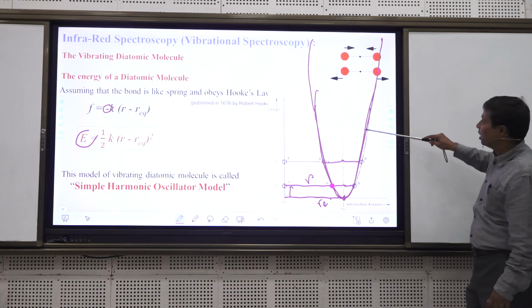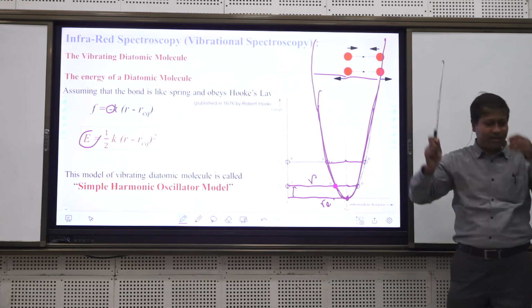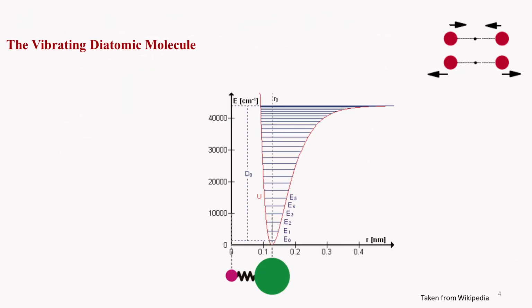So this means you stretch more, compress more, nothing happens, just increasing. This is taken from the internet. If somebody still has a problem, then you can think of it this way. So you see this atom is vibrating between these two points.